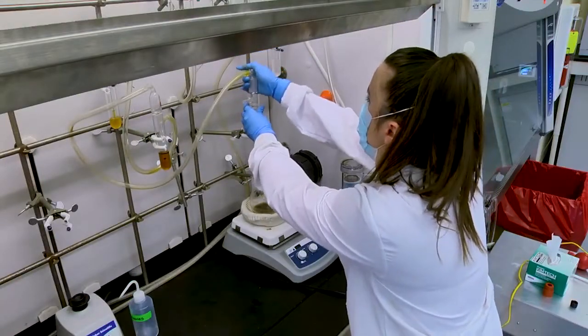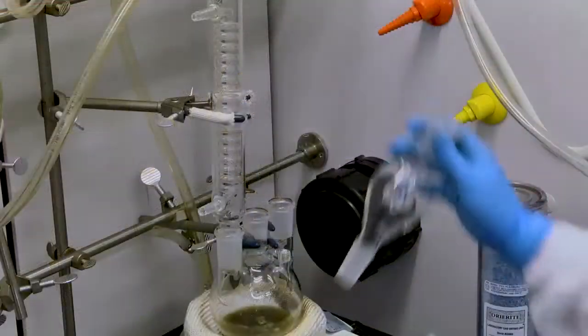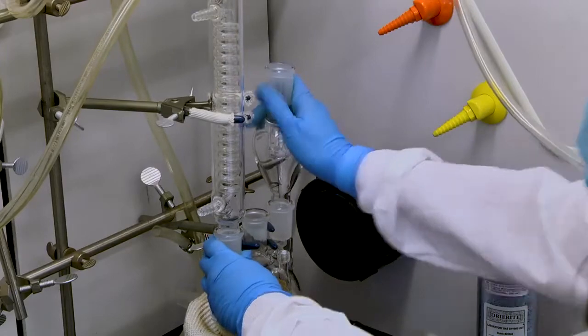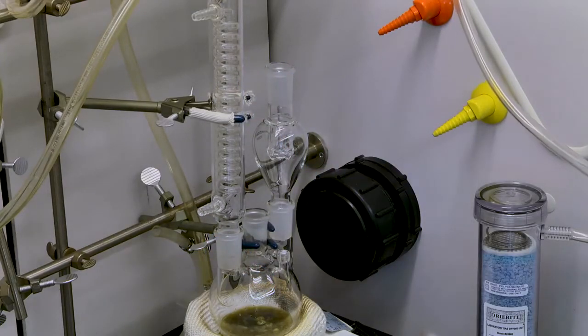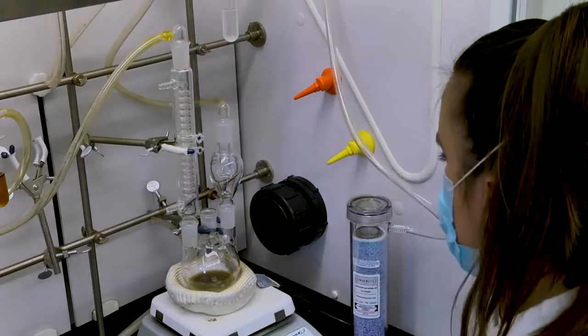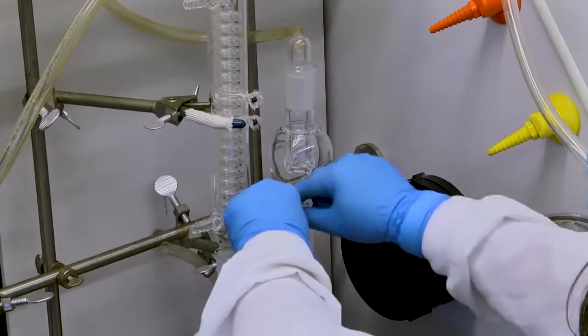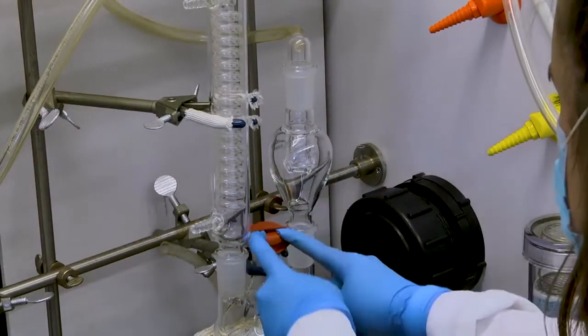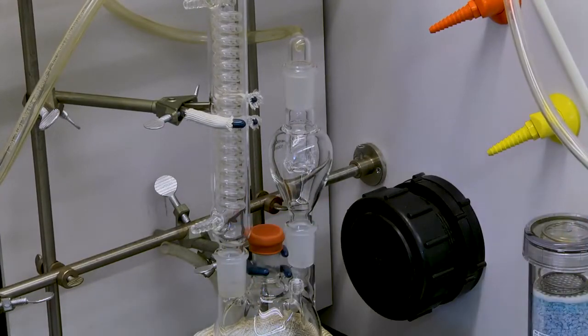Add the glass elbow adapter to the top of the condenser and attach the rotovap trap to the right neck of the round-bottom flask. Place the glass elbow adapter on top of the rotovap trap, and fold the rubber stopper on the middle neck of the round-bottom flask so the sides cover the neck of the flask.